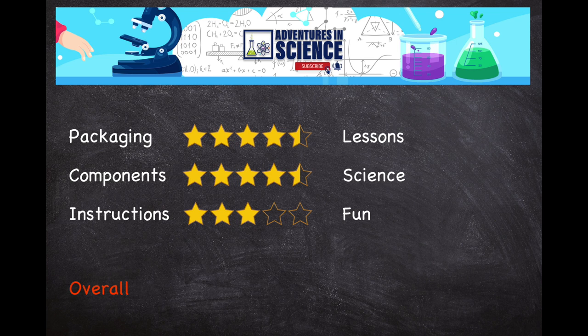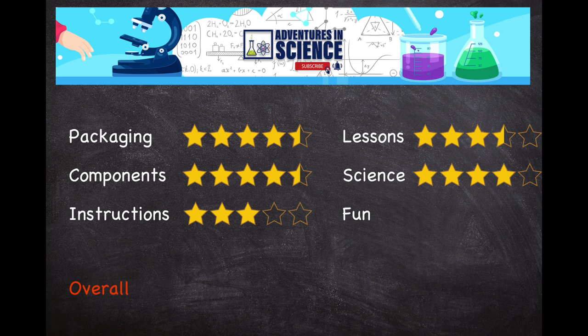Instructions, three. Very brief instructions but clearly written. Experiments, I give a 3.5. Would have been nice to see some ideas other than brine shrimp and the pre-made slides, such as lessons in viewing bacteria or bugs. Science, I give a 4. The instructions have good explanation of the components of the microscope and how to lay out specimens on the slide. There could have been more explanation of biology, but then to be fair, they couldn't possibly cater to all the items that kids are likely to put under the microscope.